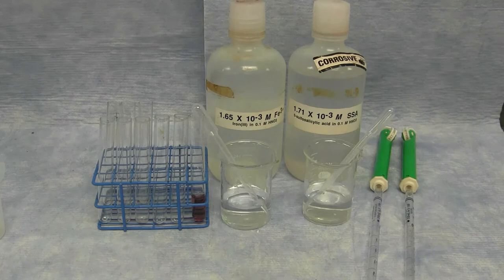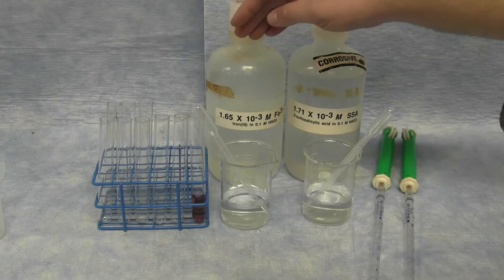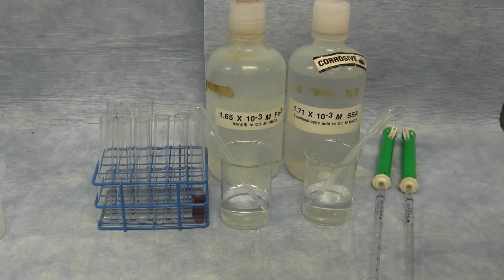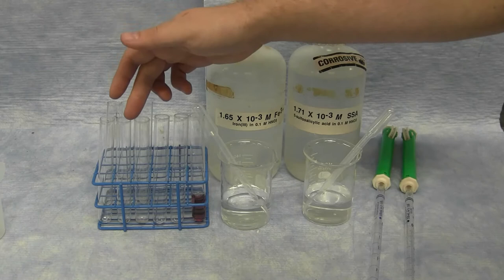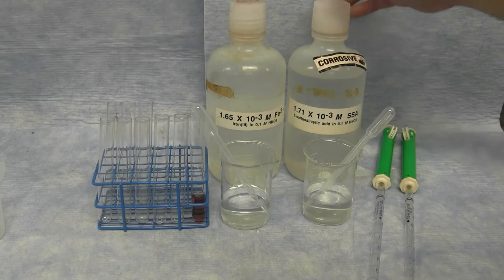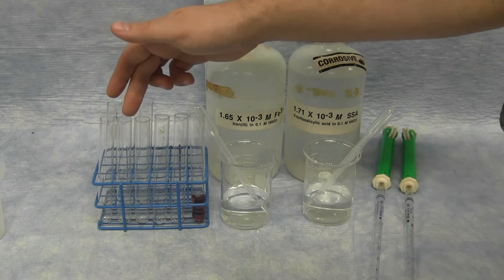You will be using the pipettes to dispense the appropriate amount of solution in each of the 9 test tubes. In the first solution, you would have 1 milliliter of iron nitrate solution and 9 milliliters of the SSA solution. In the second test tube, you would have 2 milliliters of the iron nitrate solution and 8 milliliters of the SSA solution. In each of the 9 test tubes, there will be a total of 10 milliliters.